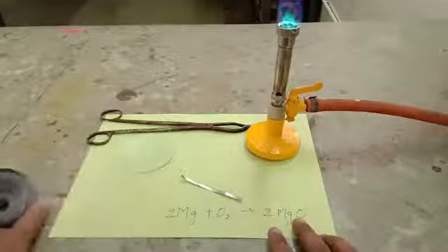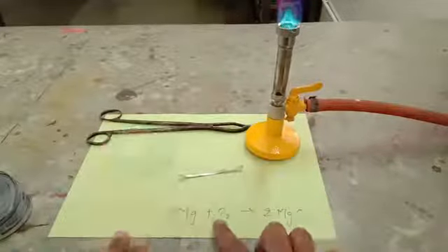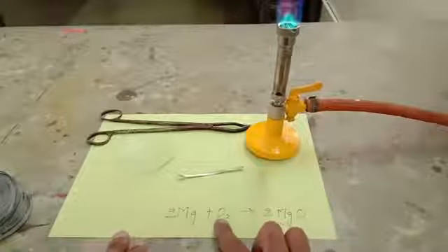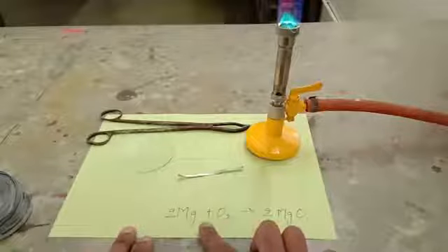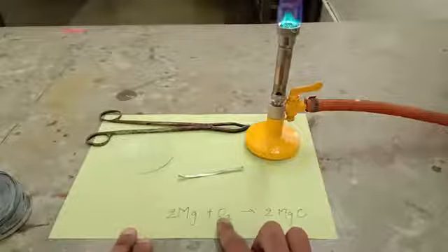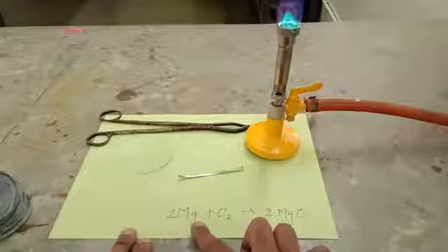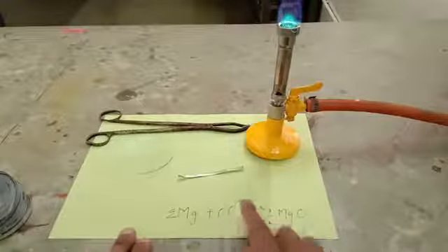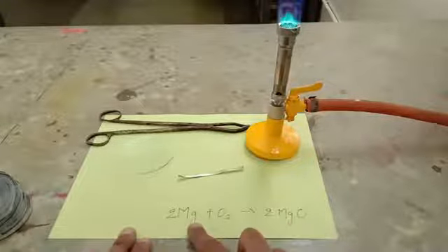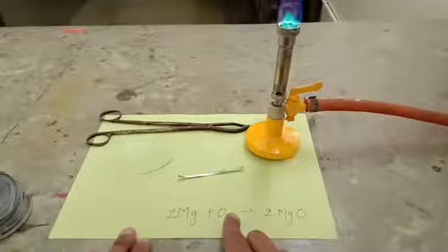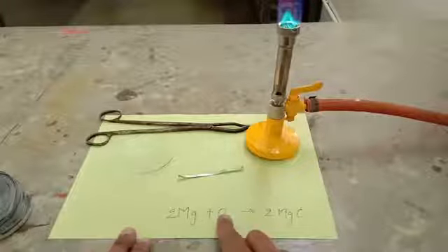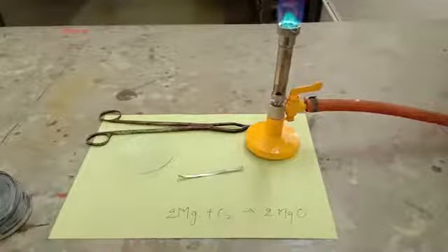When magnesium reacts with oxygen it requires heat energy and after initiating this reaction you will see that the magnesium burns in presence of oxygen to form magnesium oxide. Magnesium burns in oxygen with a brilliant white flame that is called a dazzling white flame. Very difficult to see that.